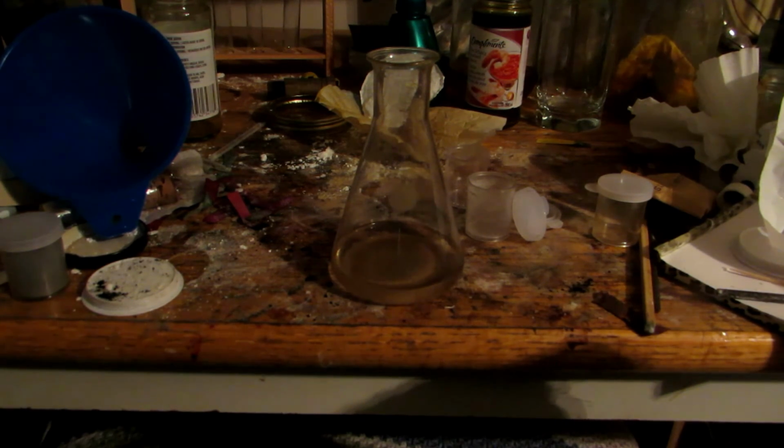So we can now quickly filter this off with a coffee filter or something, and then boil off all the ethanol to obtain a nice pure potassium hydroxide salt. So do that and meet you right back. Okay, so you can see that now that after we boiled that down, we are left with some beautifully nice pure potassium hydroxide. And this is quite pure because we have no potassium carbonate contamination.